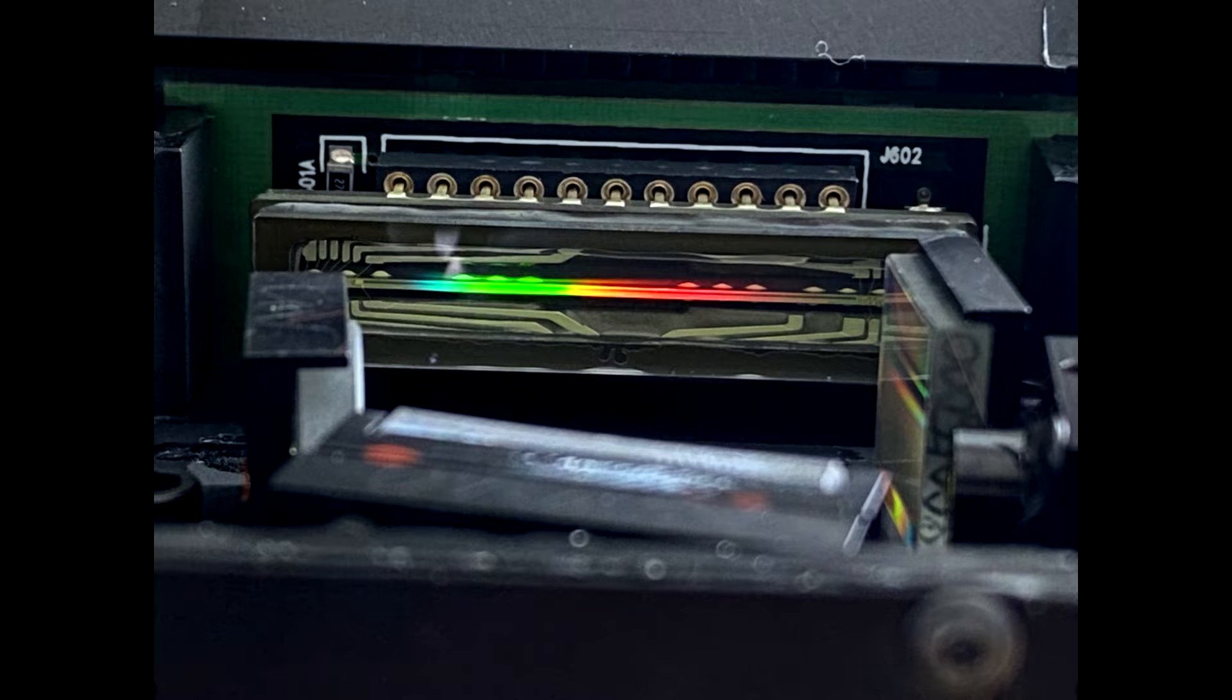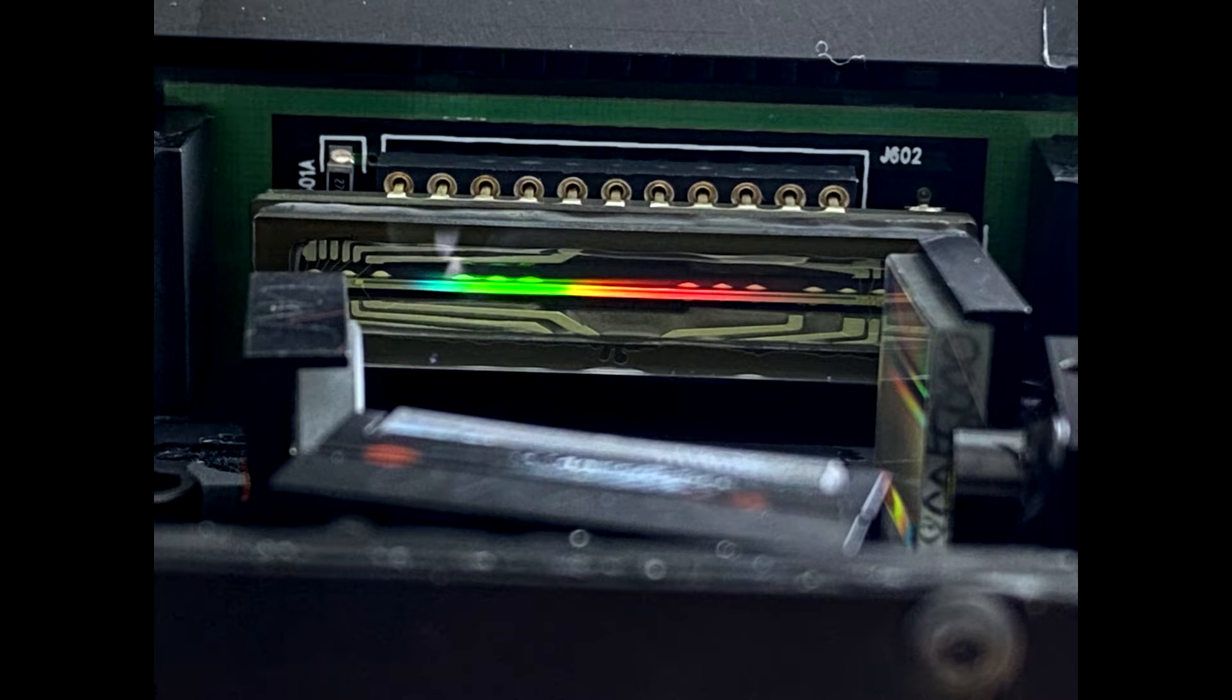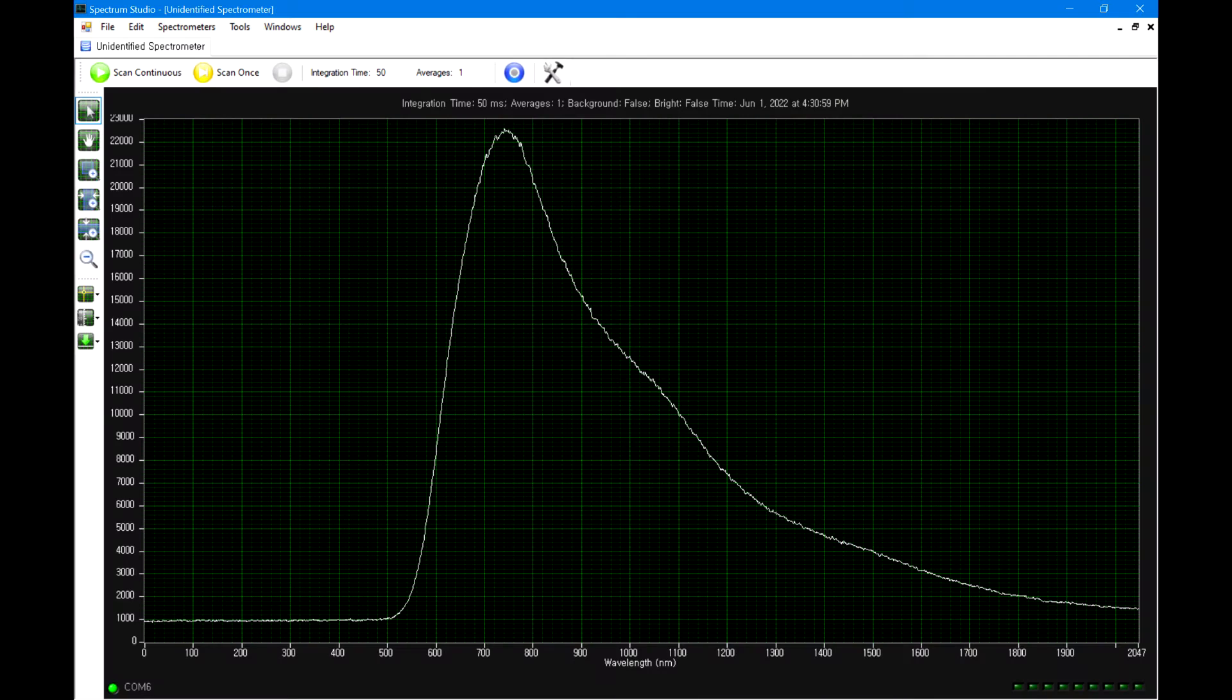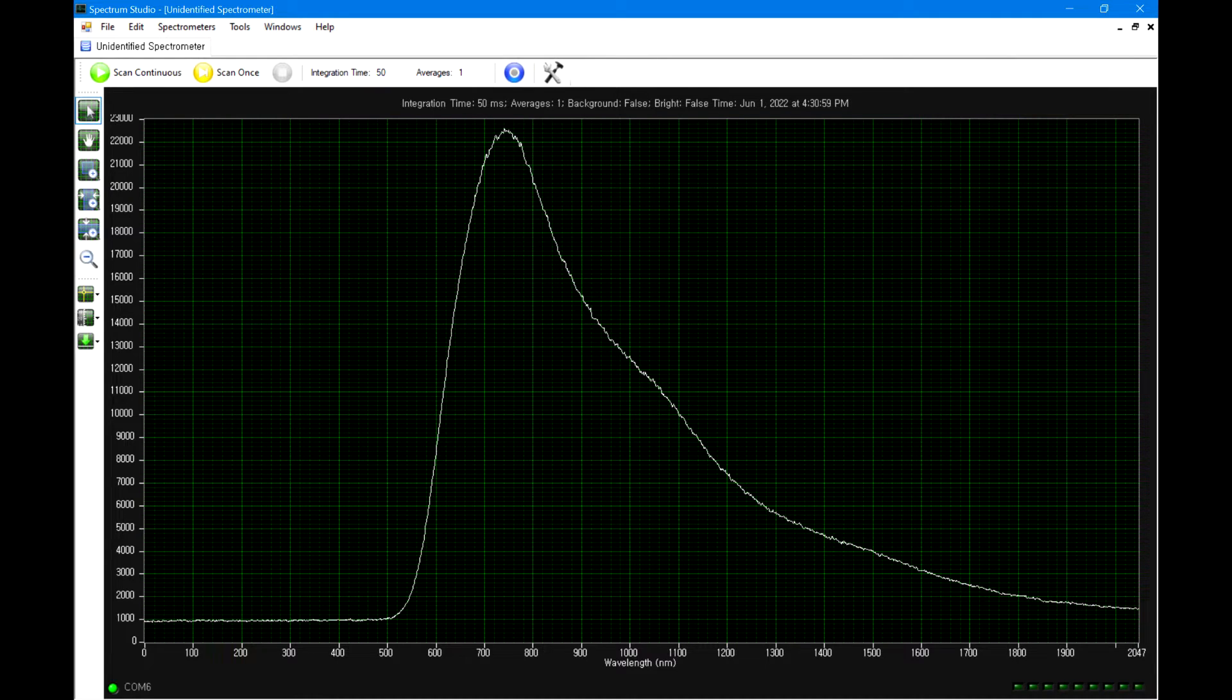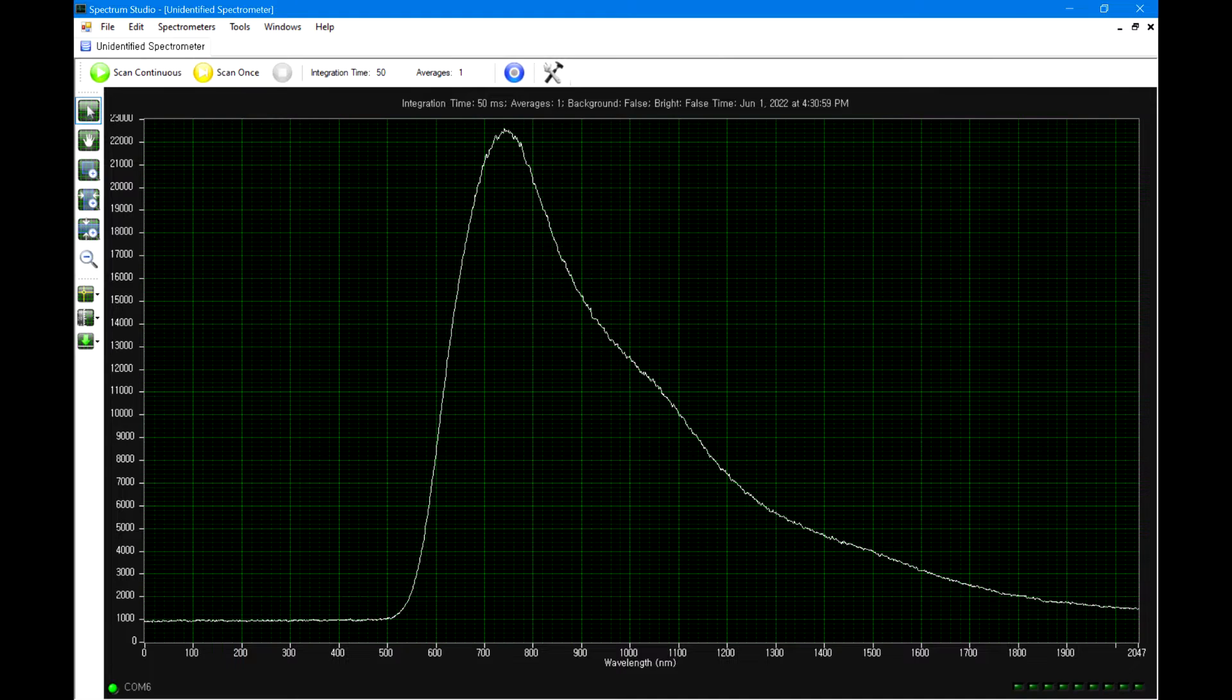After that, I closed the spectrometer and tested the system. This is a blue LED, and this time it displays the entire visible range, but the peak wavelength was off, which was supposed to be about 450 nanometers.